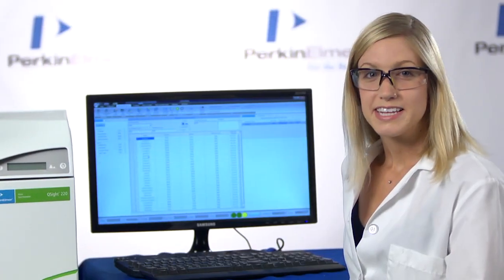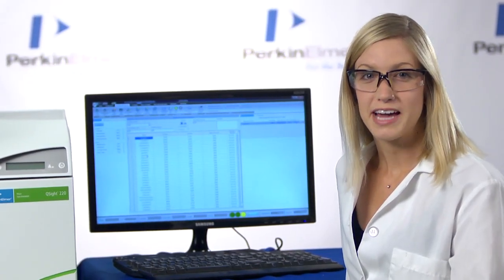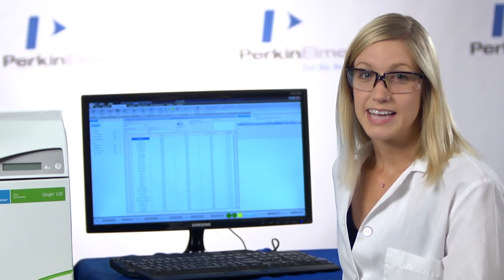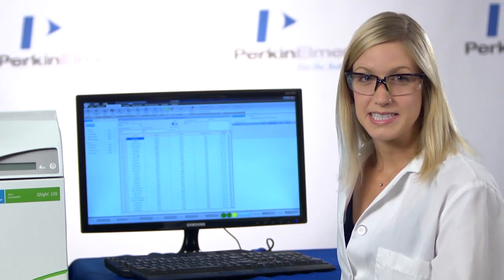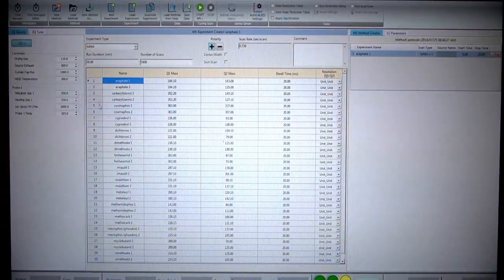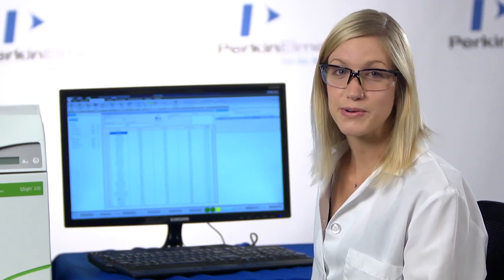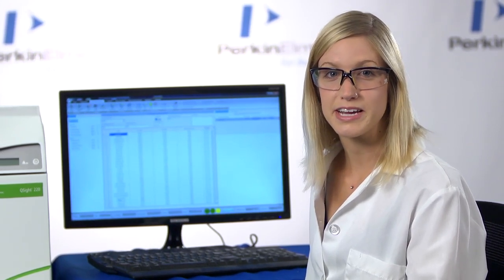Here we can enter our target pesticide masses for multiple reaction monitoring analysis. As you can see, here is a list of pesticides that we are testing for. This list can either be entered on your own, or you can use the preloaded library.